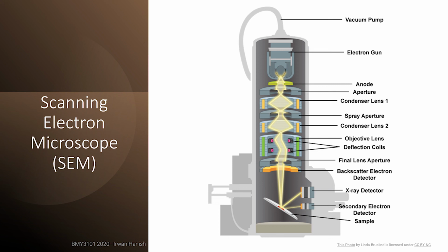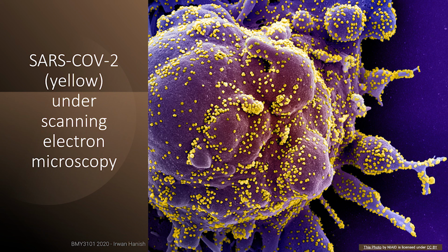And then the third one is the secondary electron detector. It detects low energy electrons and you use them to make topographic images, how the surface of the specimen will look like. And out of those data, the computer can put together 3-dimensional images that can be rather splendid. I personally always like scanning electron micrographs. If you see a good one, it grips you and pulls you into that level of reality at that moment in time.